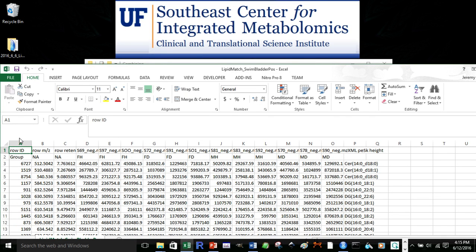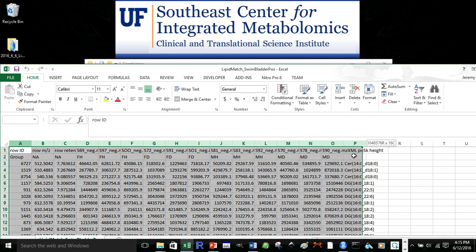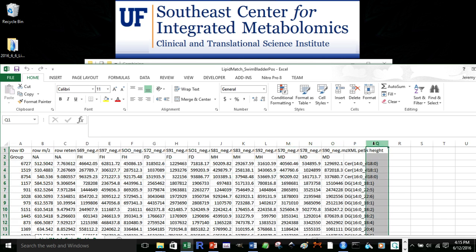And so I want to keep all this information, but now I want a new column that has identifications from other identification software for further confidence, or to gain new lipid identifications LipidMatch did not obtain.